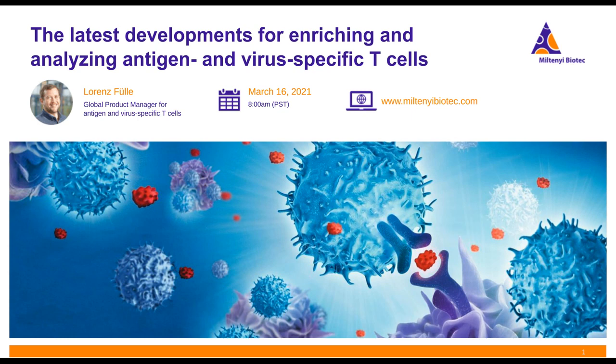So your first question, Lorenz, is, to get the PBMCs, are you using an initial source of material, an enriched leukocyte sample such as leukopaks, or are you isolating them directly, centrifuging whole blood?